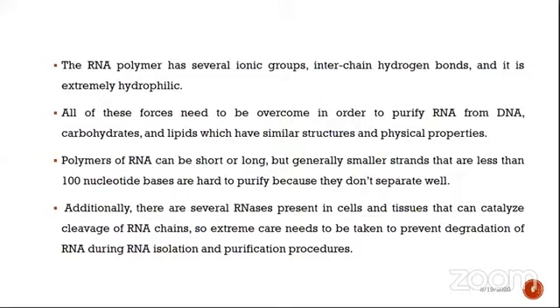In addition, there are also several RNases present in cells and tissues. So to prevent degradation during RNA purification or isolation, it is necessary to prevent these RNases, because they catalyze the cleavage of RNA chains.